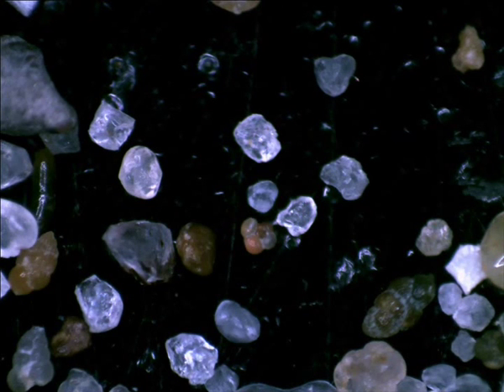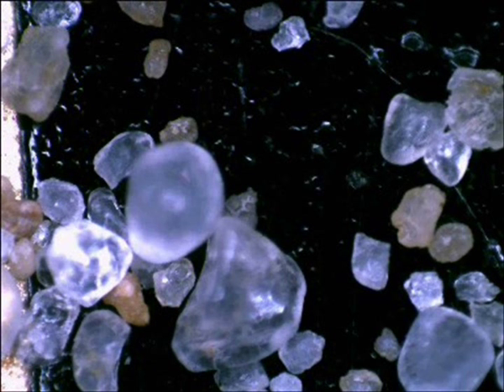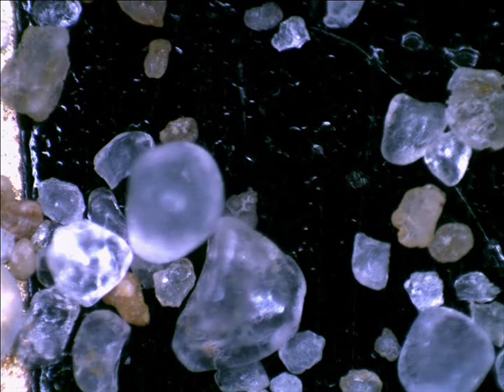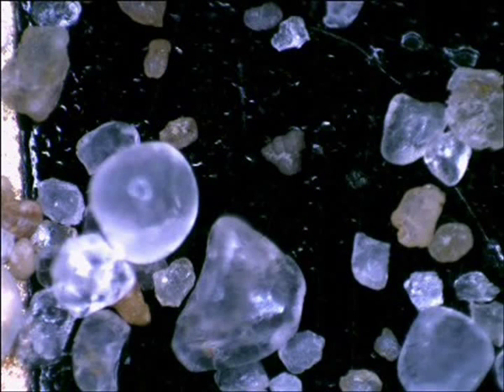And what's that? Also not quite typical beach material, because we have a planktonic foraminifera here, which usually do not live close to the beach but far out in the ocean — so it is also suspicious. What is hiding behind the quartz? I have to get it out with a pencil. I think now we can see it is biserial — it has two rows of round chambers, and also a planktonic foraminifera.